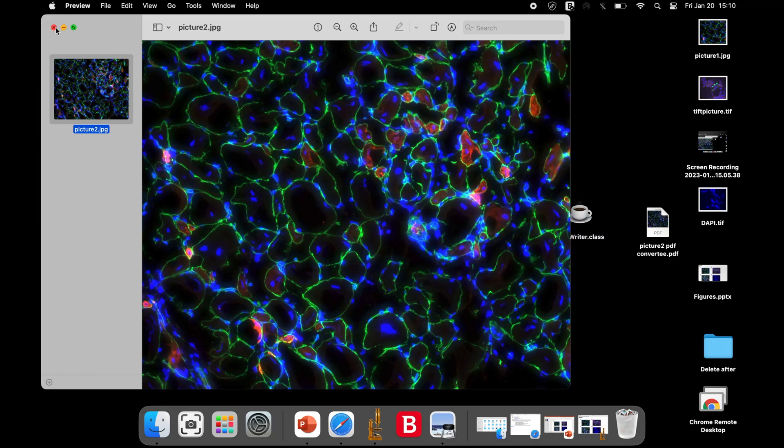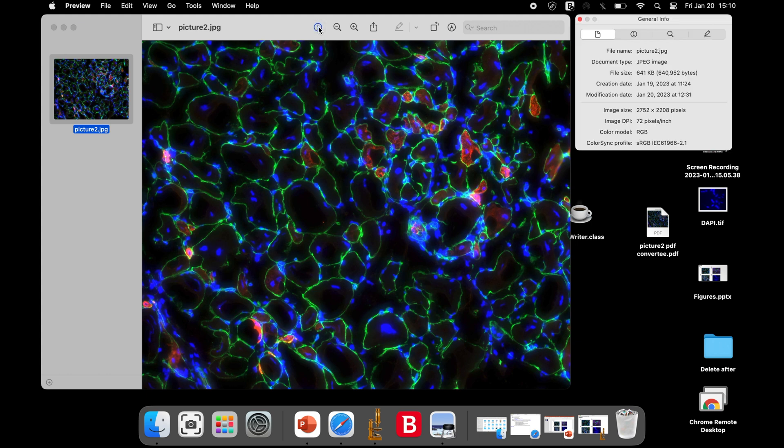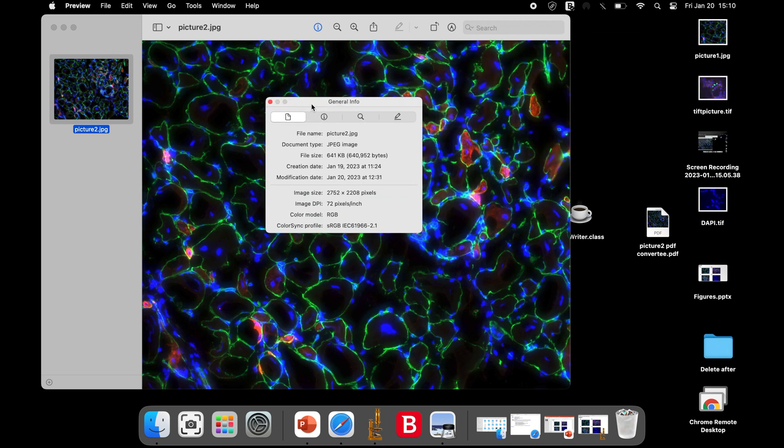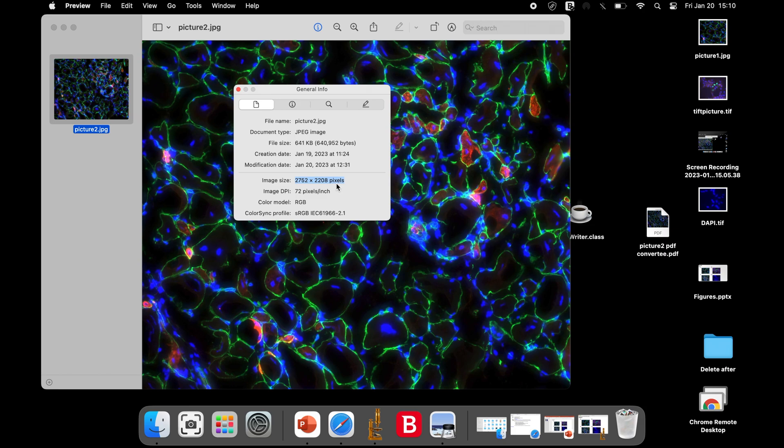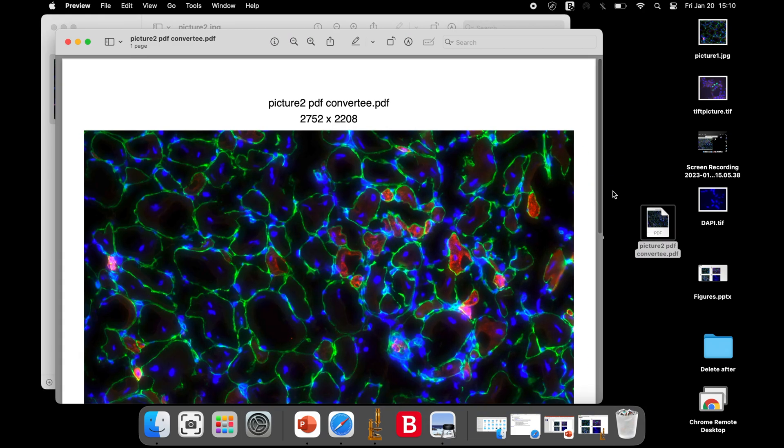Now, let us check the pixel size of the original image. Open the original image with an image viewer. Click on the Info option to get the details of the image. The size of this original image is also 2752 by 2208. Again, this pixel size is same as the pixel size in the PDF format.